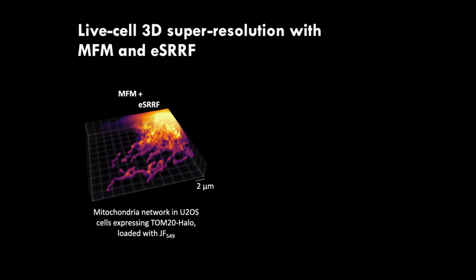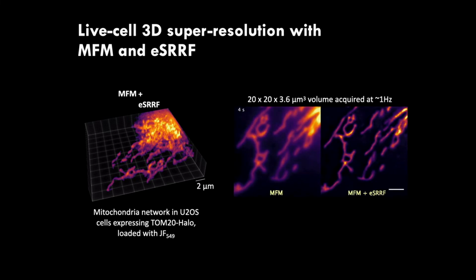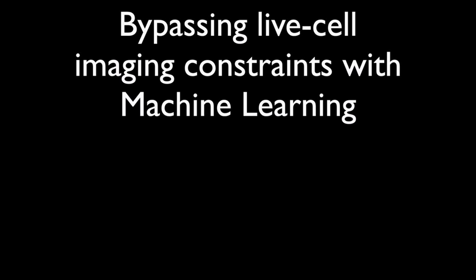And that means that by applying eSRRF, now we get full 3D volume super-resolution enhancement on the data. And we can do it live, right? Which is one of the good benefits of doing it. So what you're seeing there is one volume per second on the movie that you have on the right. So that's what I wanted to tell you about eSRRF. Check it out, fully open source, runs on Fiji. We provide data to test, use your own data also, and enjoy it.